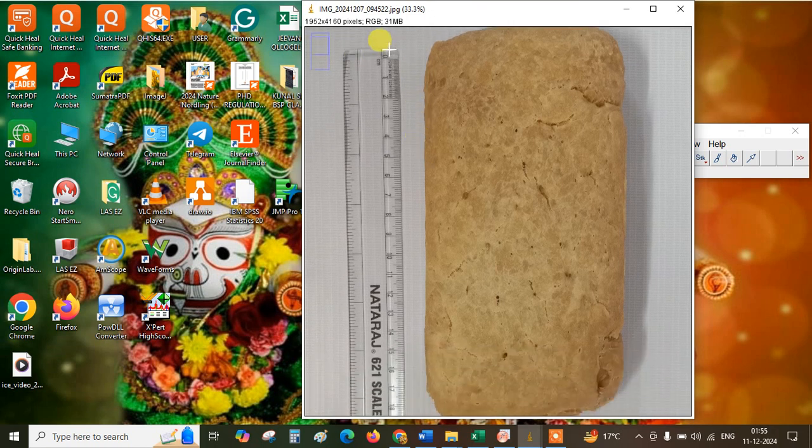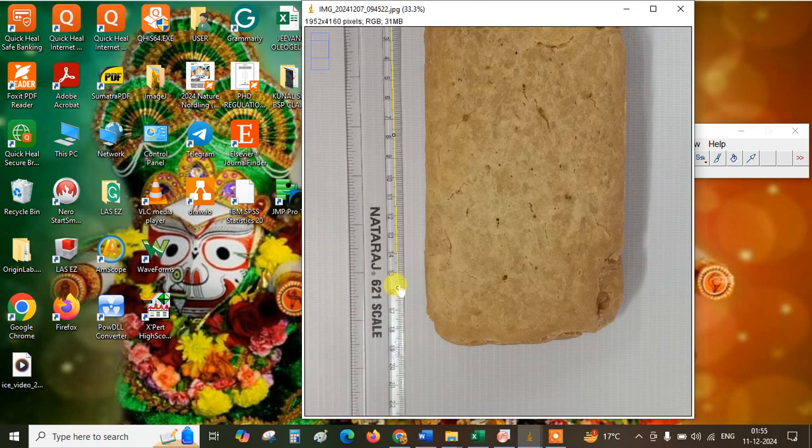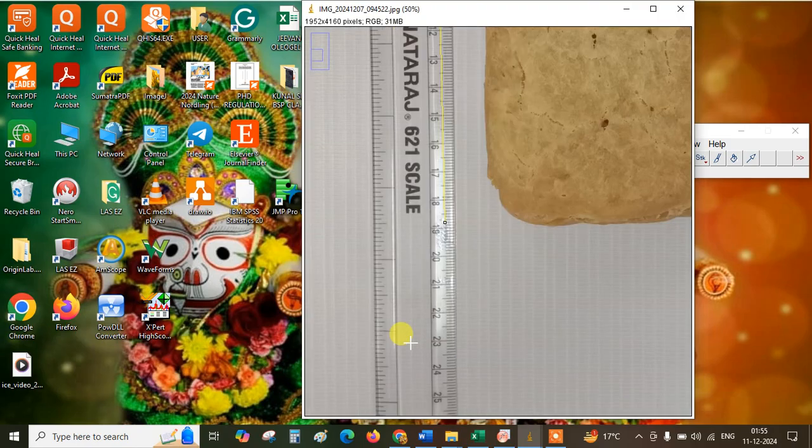we'll simply drag the line. Now this line is very important because it sets the baseline for our measurements, whatever we want to do, depending on our experiments or analysis. So I will drag it to here. Quickly we have to check how much it is. We should always try to draw a straight line. Let's say it's 18.5. So I'll go here, and I think it's 18.7, right? This is curved, but somewhat it's a straight line. So we will assume it is around 18.7.